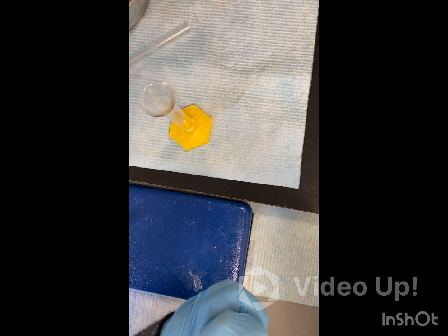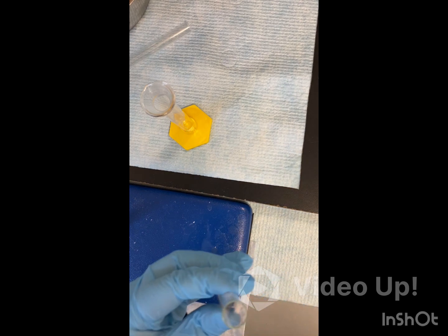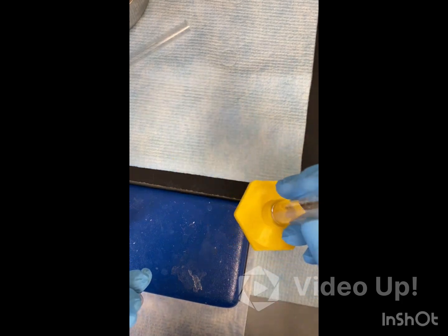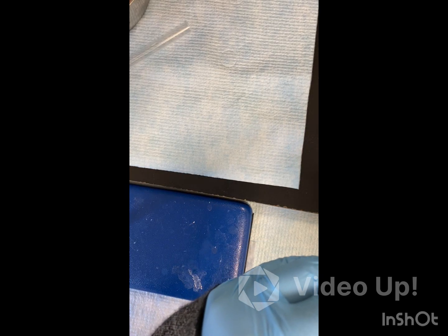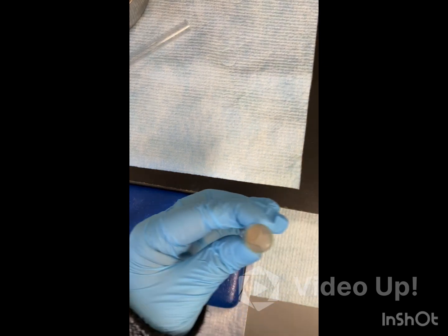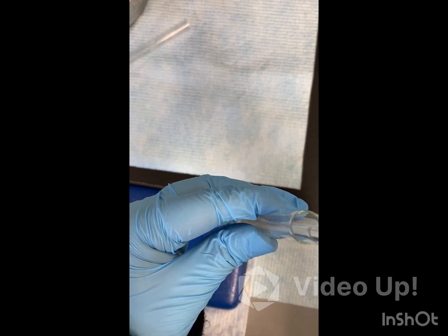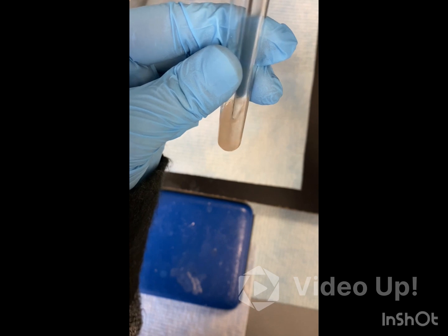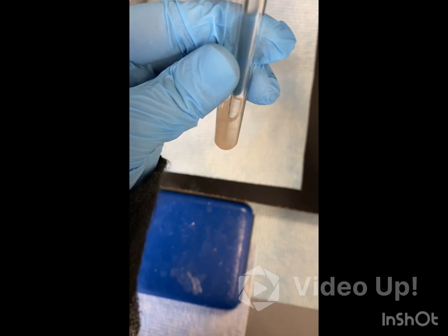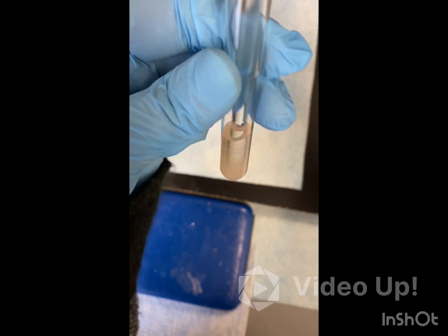We're going to add our vanillin acetate into our test tube. We're also going to add 2 ml of 95% ethanol — I went ahead and measured out 2 ml, and we're just going to add that to our test tube as well. Then we're going to add a glass stir rod and give it a good mixing. Just be gentle and don't break the glass rod.